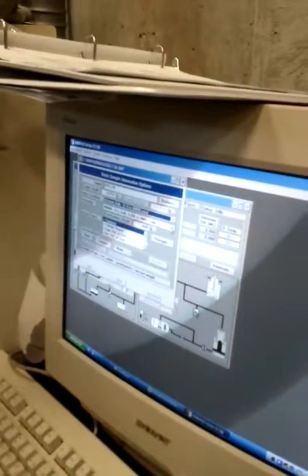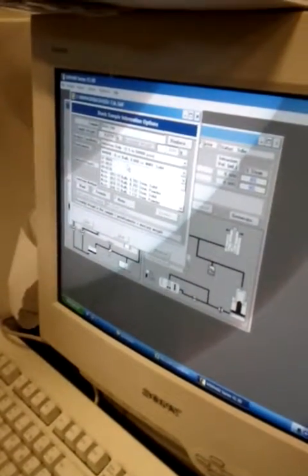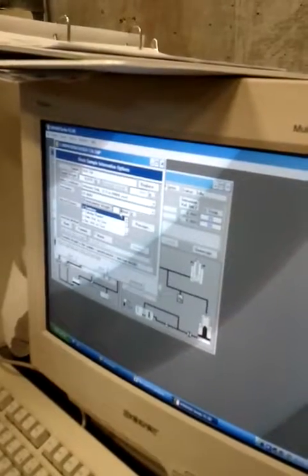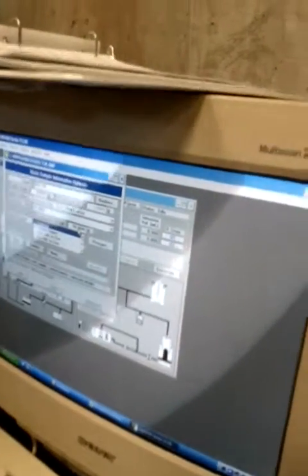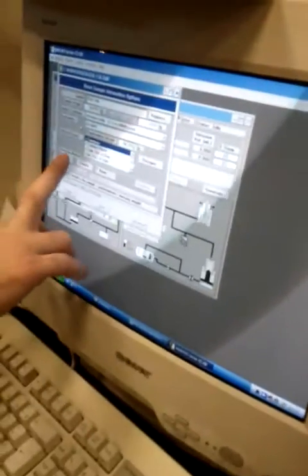And now we have to select the penetrometer. That's why it's important to note it on our sheet. So it's the 070849, this one. And now we have to give the weight of the penetrometer with the sample, the second weight that we measured. And we have no correction method, so it's no. Maybe later we will have some, but for the moment it's no correction method.